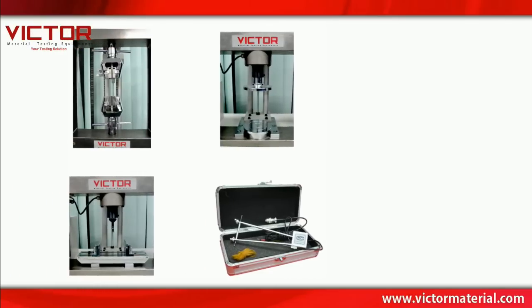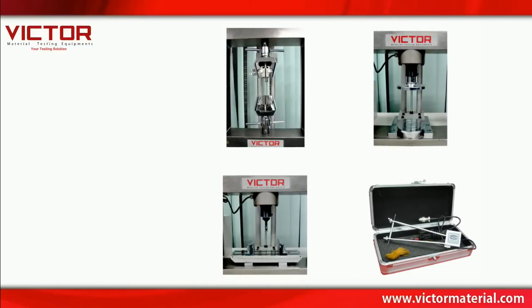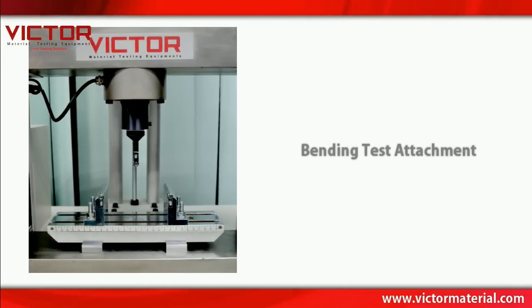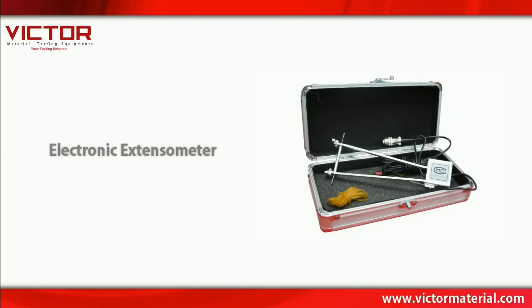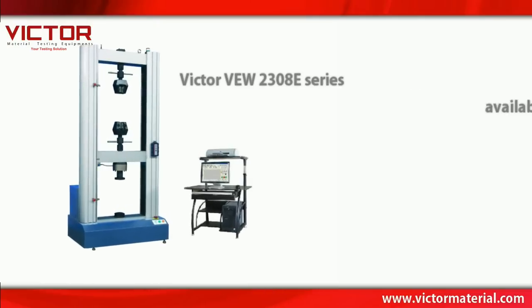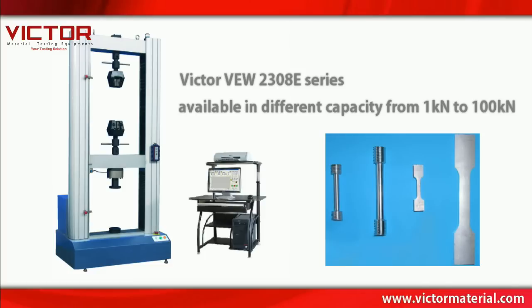The standard model of the Victor VEW 2308E series comes with a finely engineered tensile wedge grip, compression test attachment, bending test attachment, and electronic extensometer. The Victor VEW 2308E series is available in different capacities from 1 kN to 100 kN.